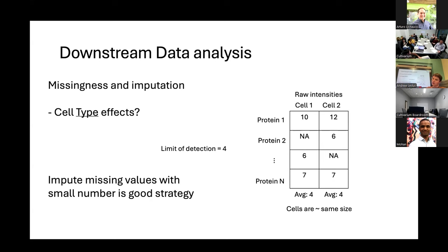For anyone who's followed RNA-seq, there have been about 17,000 papers on these things. And I imagine there'll be many, many papers on these as more protein data sets become available. Speaking of which, is there a way to spike in an orthologous organism?